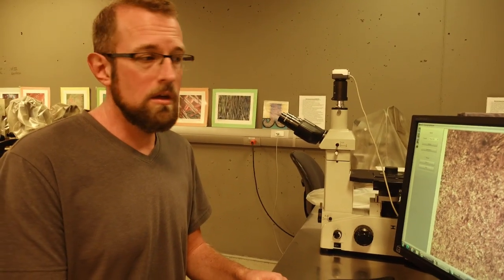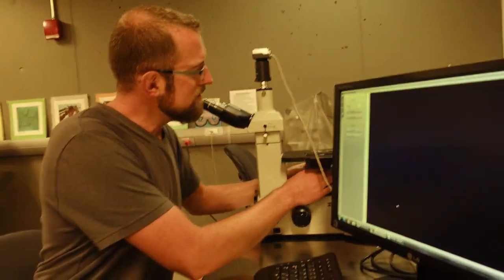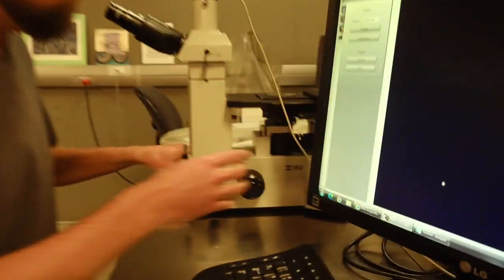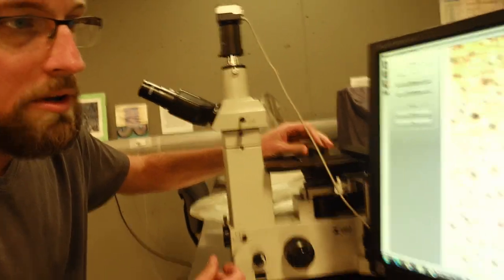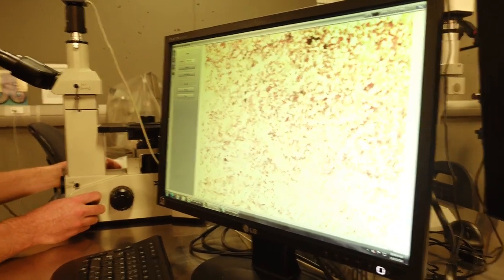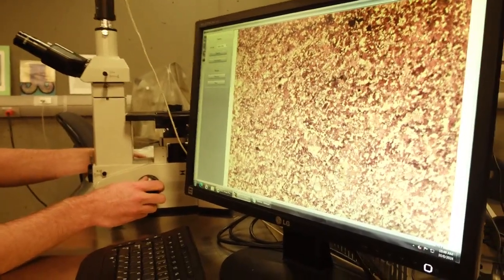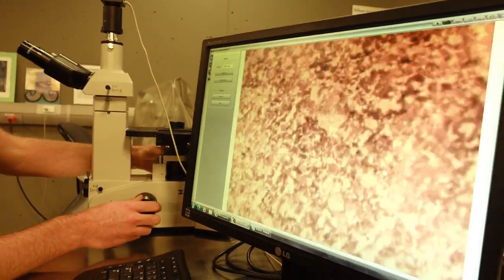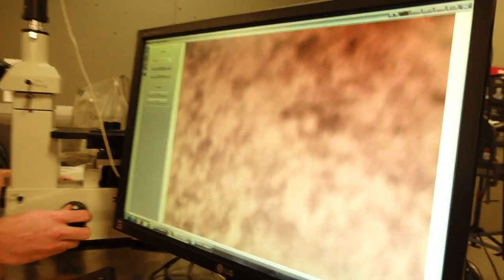So what if you don't quench it then? If you cool a little slower, something else is going to happen. Let me just switch over here to an annealed material instead. Annealed means it's been slowly cooled in the furnace. So rather than quickly cooling it in water like the last sample was, this one was very slowly cooled. And even when we're zoomed out here, you can start to see the difference between these two samples.